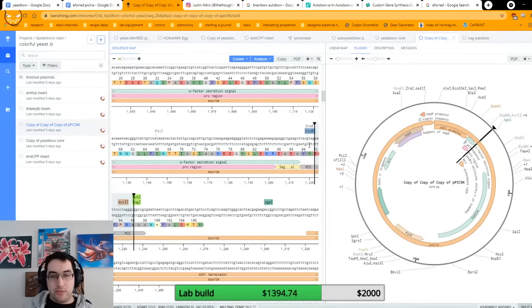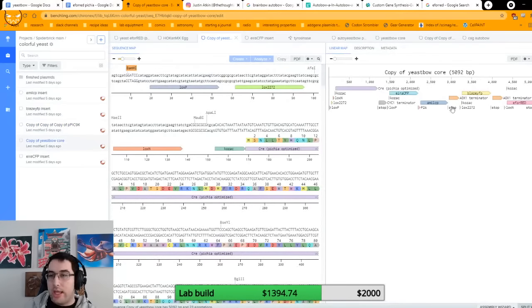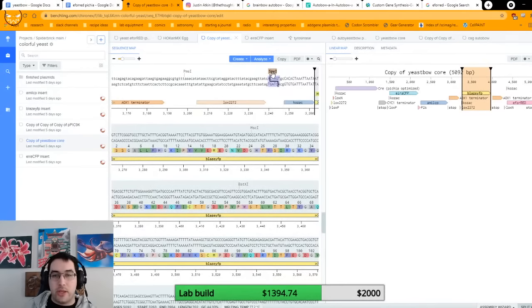It will not, right? The pieces don't stick, and if they don't stick, it's no good. So I have to make adapters to go from this restriction site to whatever's actually on the protein. If I go to the yeast bow core and pick Blaze YFP, this one has an SpeI site, but I need the front end to be EcoRI. Obviously these two things don't match.